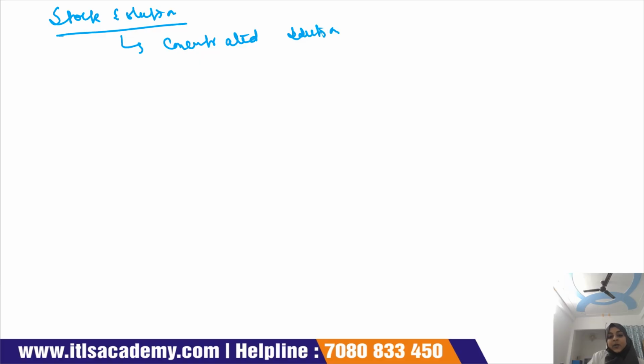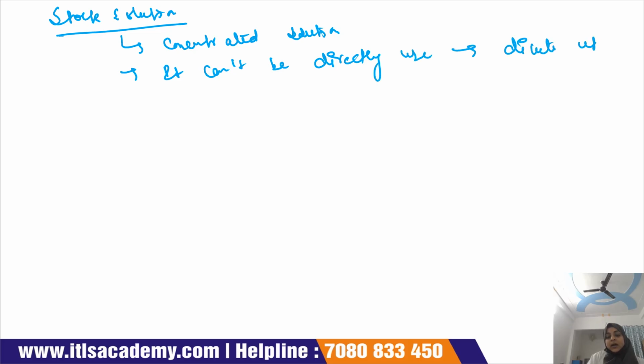Okay, and it cannot be directly used. We have to dilute it. Now this stock solution is either a molar solution, or a normal solution, or a percent solution.